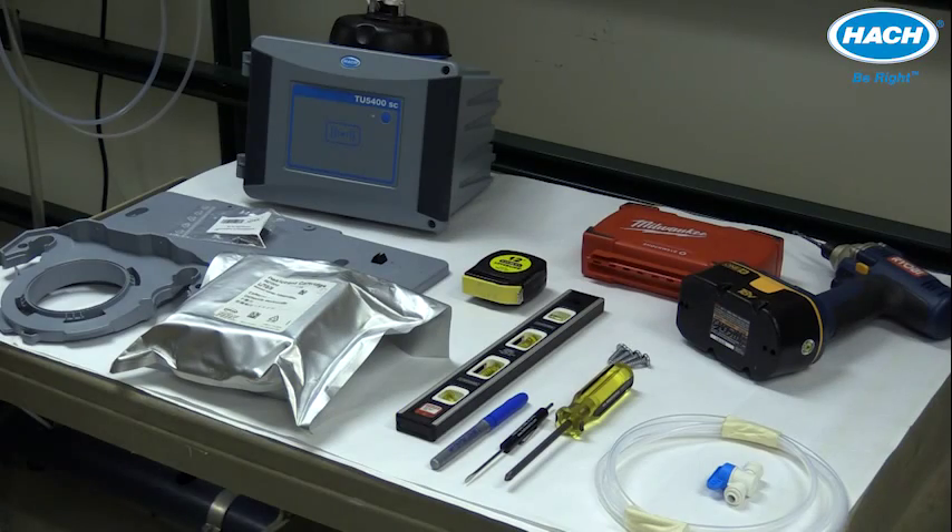Before getting started, make sure you've received everything listed in Figure 2 in the user manual. Note that EPA versions of the process TU turbine meters also include a bottle of stable cal solution and a syringe for easy calibration.